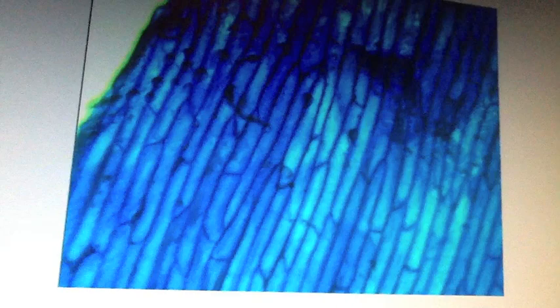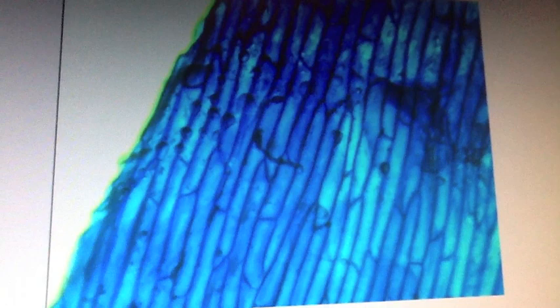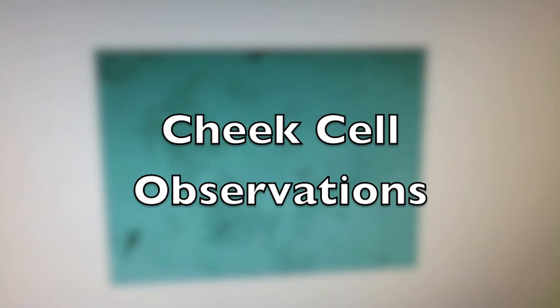Look at those protein packages. Strongly visible structures. Even more distinct now that the stain has had a chance to saturate through the cells. And you can see, yeah, like you can really see the cell wall much more vibrant now. And this one down here, there seem to be multiple structures visible. You know what that could be? We might be seeing the central vacuole. Essential to maintain the shape and structure. Yeah, and storage. Wow.